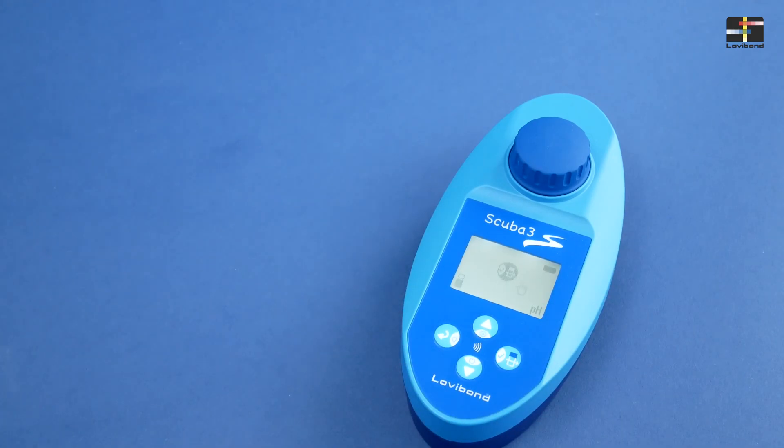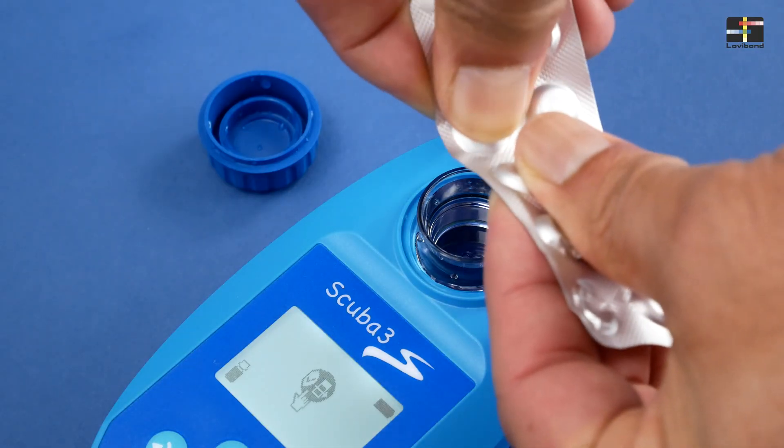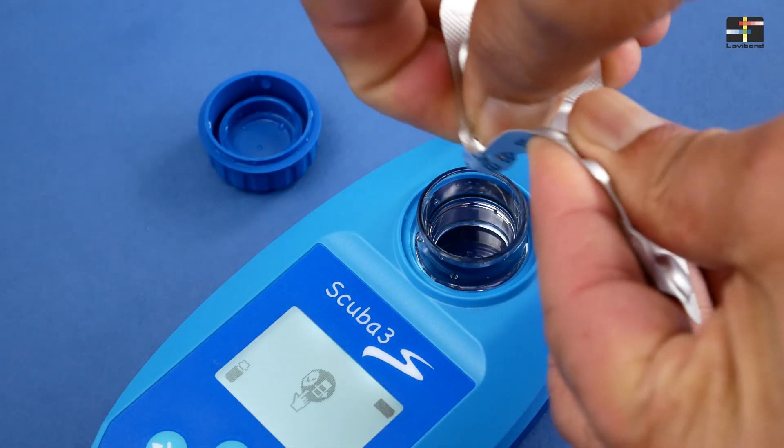To determine the pH value, use phenol red tablet. Add a tablet directly from the blister foil to the water sample. Take care not to touch the tablet with your fingers.